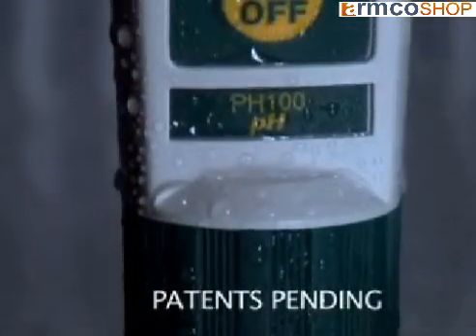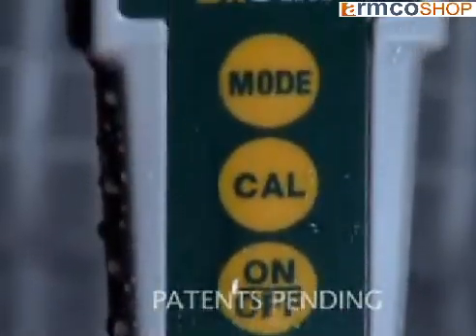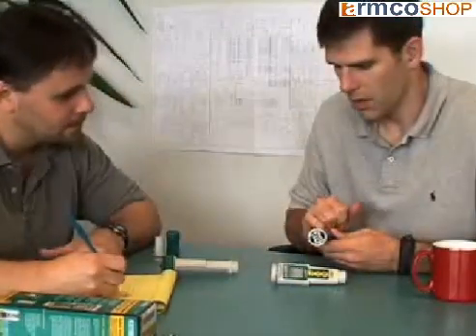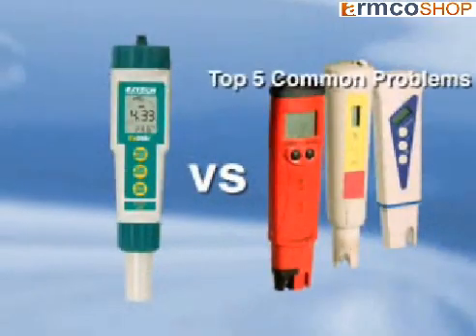Introducing the waterproof X-DIC pH meters designed with innovation in mind. X-TEC design engineers have developed the X-DIC pH meters to offer solutions to the typical problems you face while using an ordinary pH tester. We will offer solutions to solve the top five problems a pH tester frequently faces.